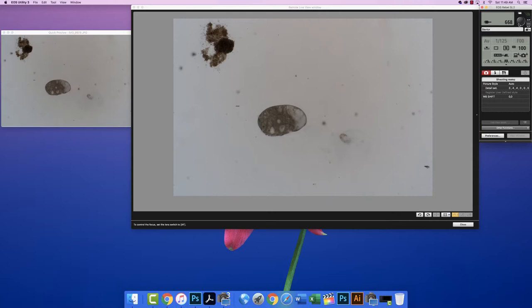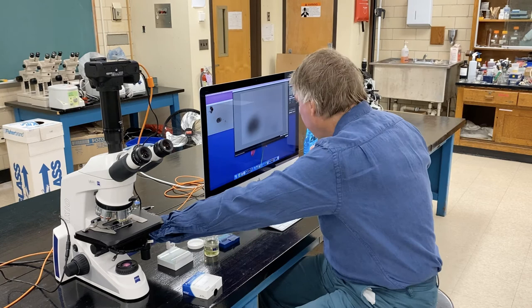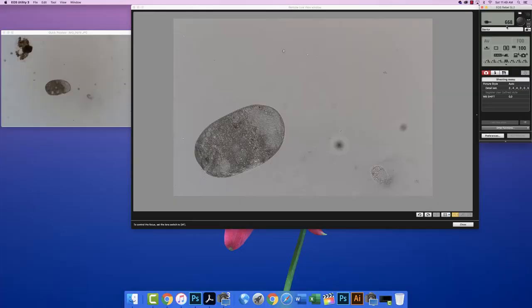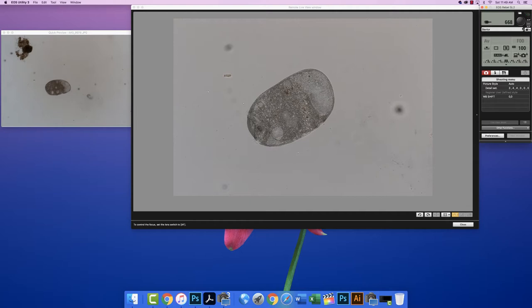And now I'm going to go up to 10x because this is pretty low mag. So let's swing the 10x objective in place. And here he is under a little bit higher magnification. Try to center the critter a little bit. And I'm going to take a photo.